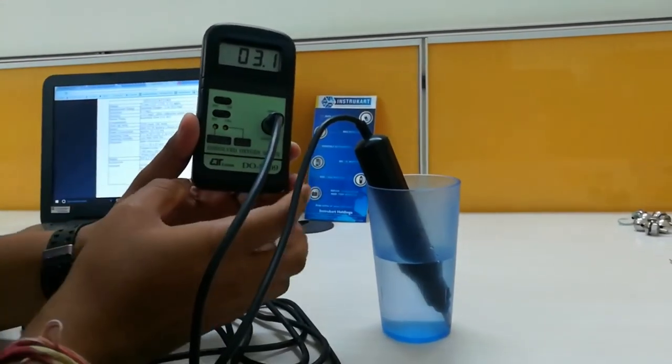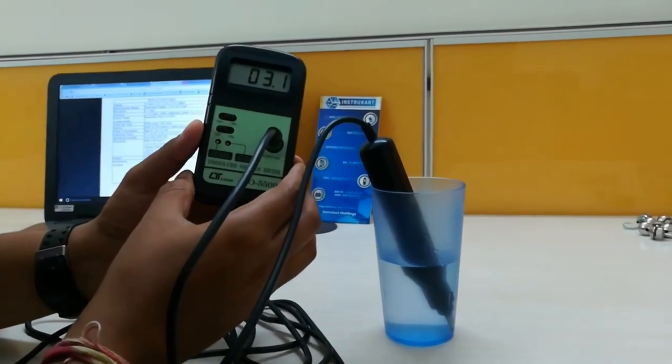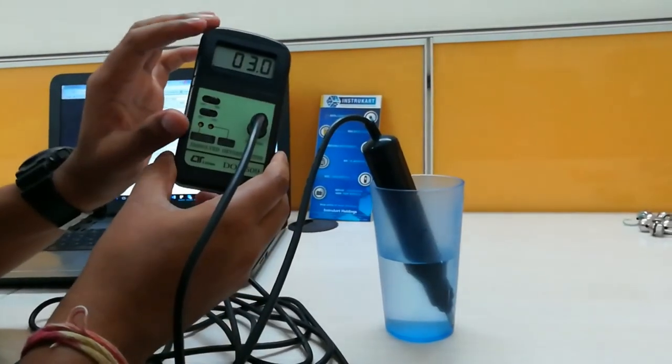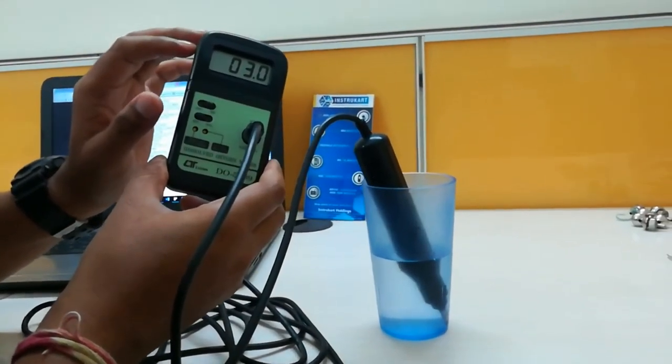You can see the difference. We also have a pen-type model in Lutron.